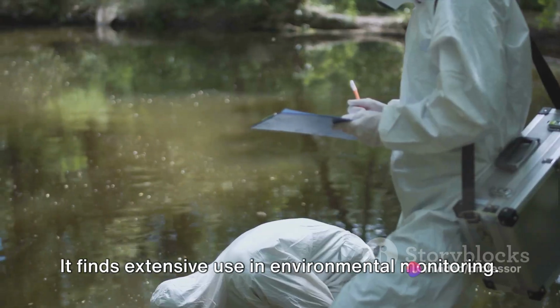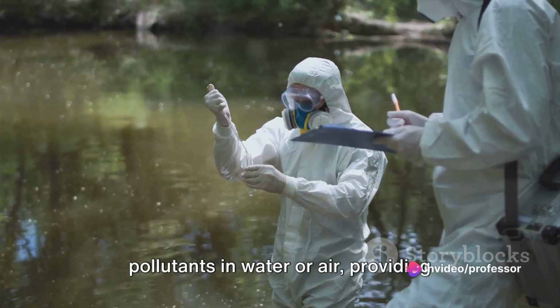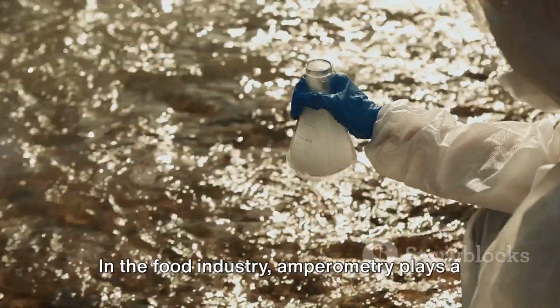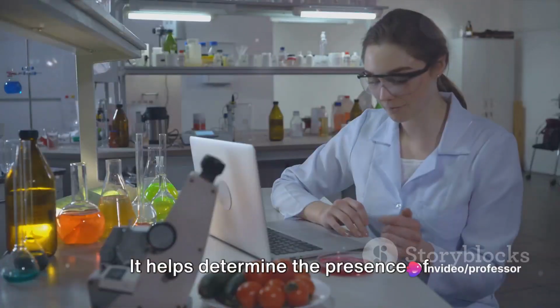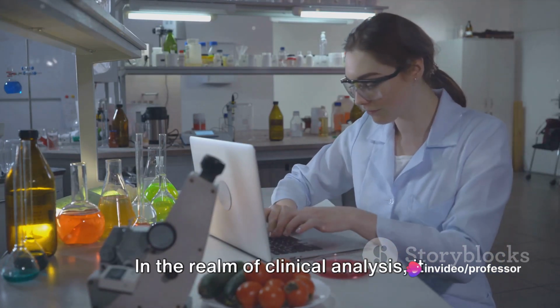Now let's delve into the fascinating world of amperometry applications. It finds extensive use in environmental monitoring. For instance, it aids in detecting pollutants in water or air, providing crucial data for environmental protection efforts. In the food industry, amperometry plays a vital role in quality control. It helps determine the presence of additives, contaminants, or even the freshness of the product.